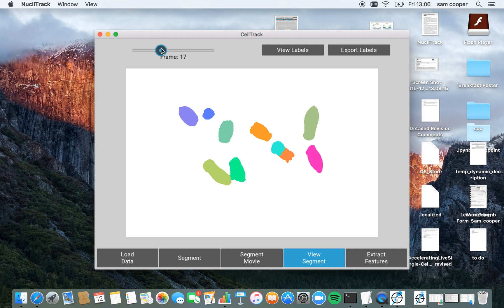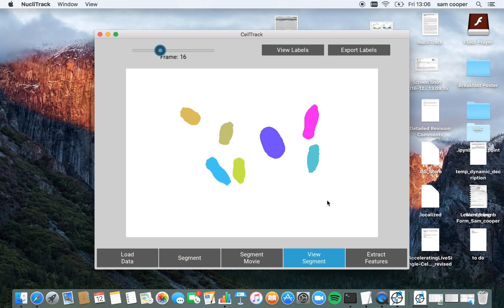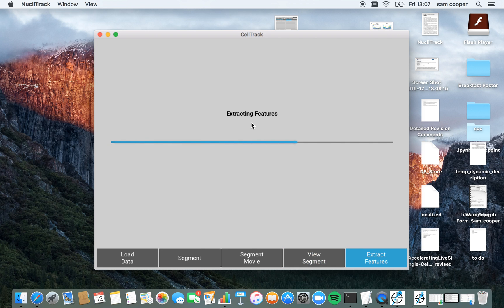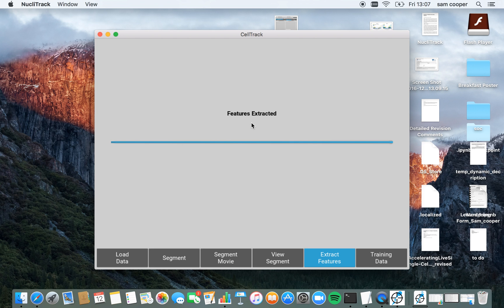So I'm now happy with this segmentation. I'm going to go extract features and this is going to pull out all of the features about these segments. This goes much faster than the segmenting image loading bar before.